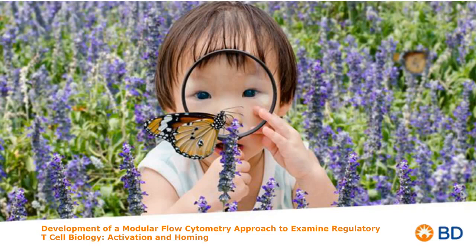So in this situation, I was working with a FACSLyric that has 12 detectors off a blue, a violet, and a red laser. But for example, on an 18-color instrument, you may have a UV laser or a yellow-green laser. And all of these have other fluorochromes that are extremely valuable. And you may choose to use something such as BUV395, a very clean fluorochrome that could be either dropped into your base panel or saved as one of your drop-in panel fluorochromes. So really it depends on your particular instrument and how you're trying to build this panel and saving the things that are important.